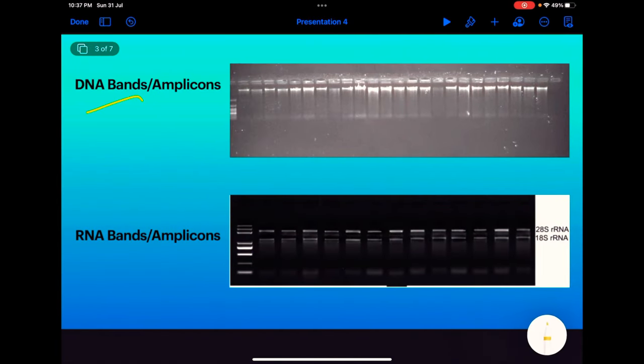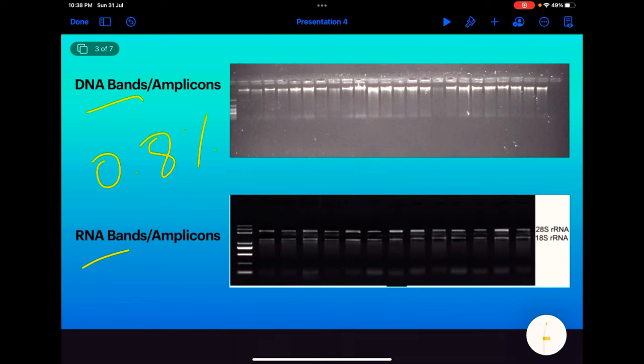This is how DNA and RNA bands look like on a 0.8 percent agarose gel. In this picture, one microgram DNA in each lane along with gel loading dye was loaded, and after half hour the gel picture was captured with the help of documentation unit. If you get a fluorescent appearance in your lanes or some smear in your DNA bands, there might be RNA or protein contamination in your DNA samples. In this second picture you can see there are double bands in case of RNA. These bands are two forms of rRNA: 28S rRNA and 18S rRNA, that is ribosomal RNA.